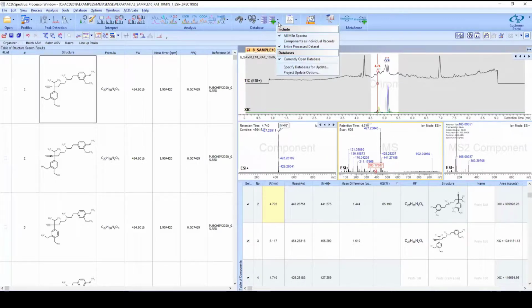So typically what we would recommend is we'd have a conversation with you to help you determine which update mode is best suited for your application with how you want the data organized. And once you have it sitting in the database, you now have something that can be accessible by various people that you can do different types of searches on. So spectral search, a metadata search, or a structural search.